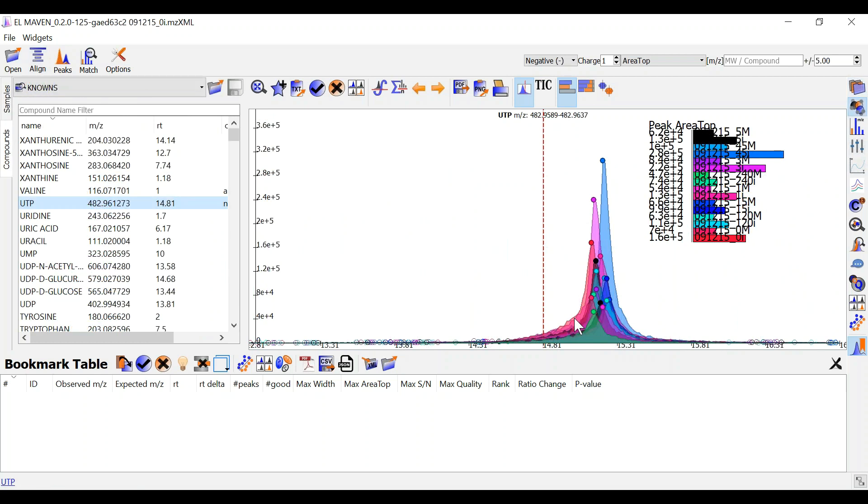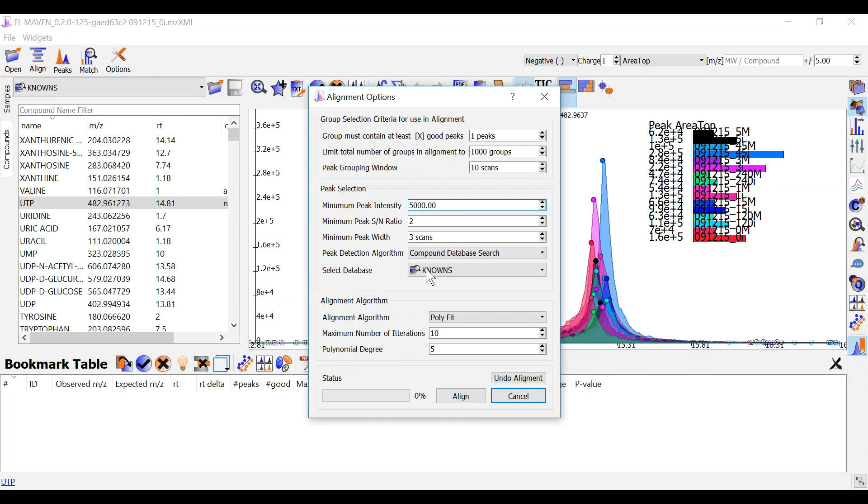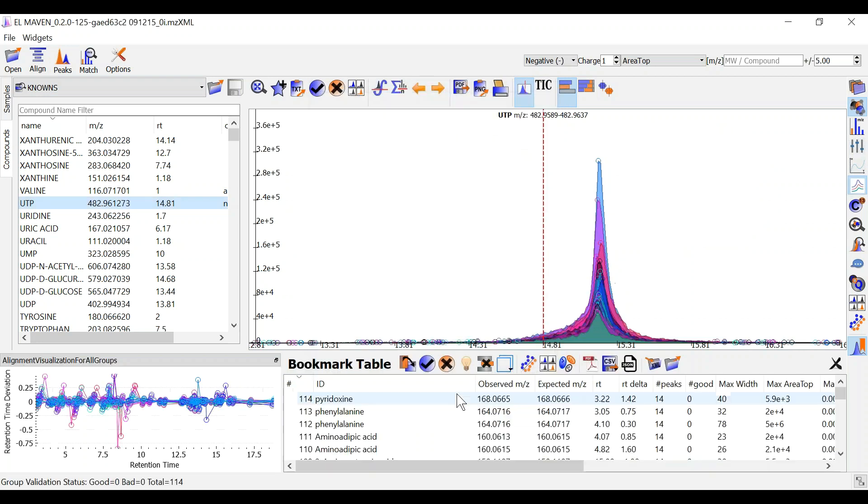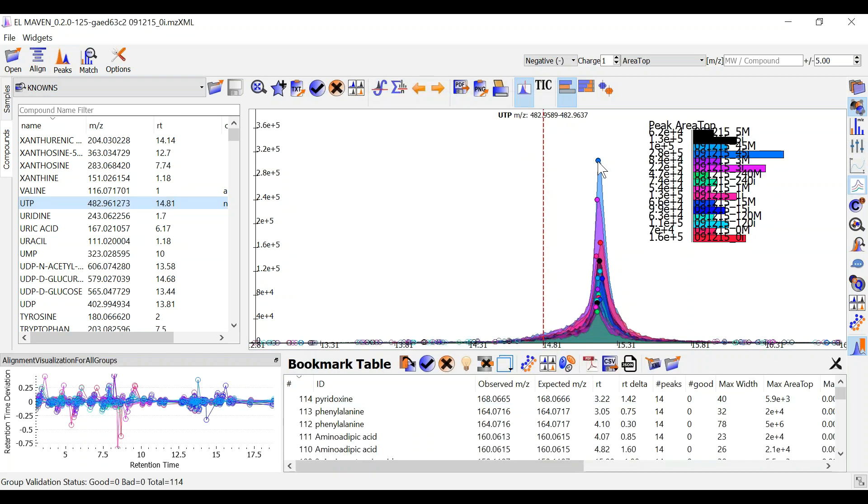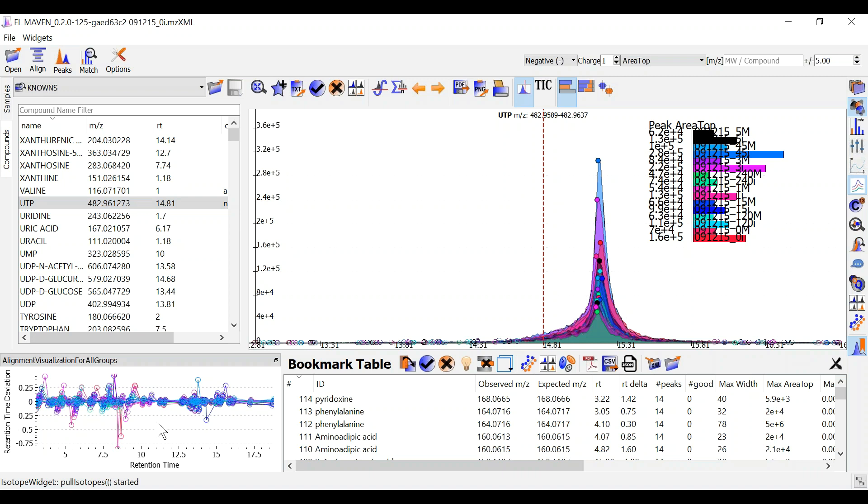Consider this group. You can see that the peaks are dispersed over a broad range of rt's. When I perform alignment, you can see that the peaks are closer to the median retention time. The alignment visualization here helps you assess the retention time drifts in each of the peaks in this group.